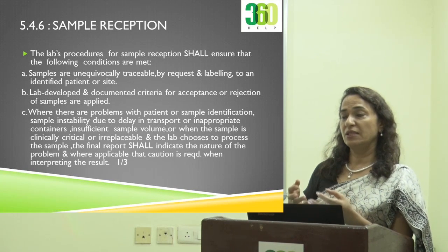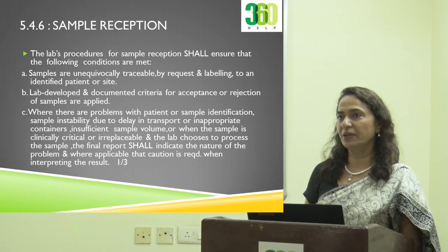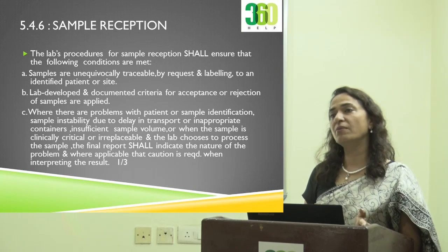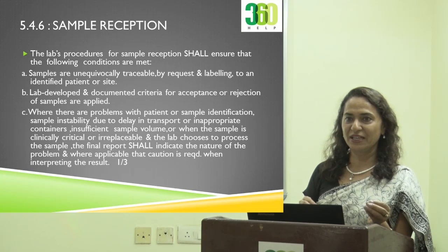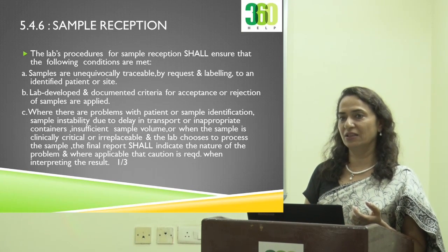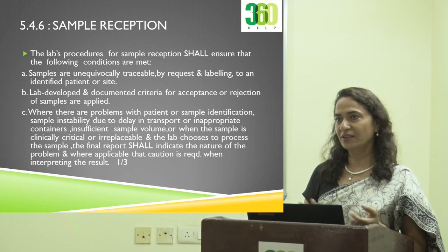But for CSF, and maybe sometimes for other fluids also, which you can't replace, you need to process, then track, then confirm. Because giving a wrong report is also as bad. If you've given somebody else's report to somebody else, that is also wrong. So ensure in writing that this belongs to this person, then release the report, right?